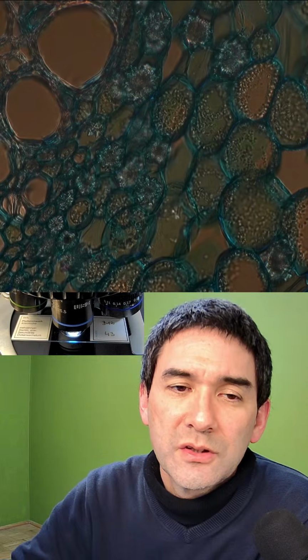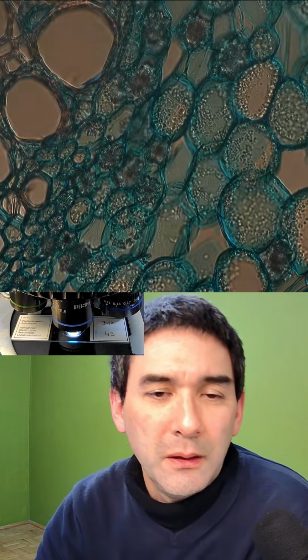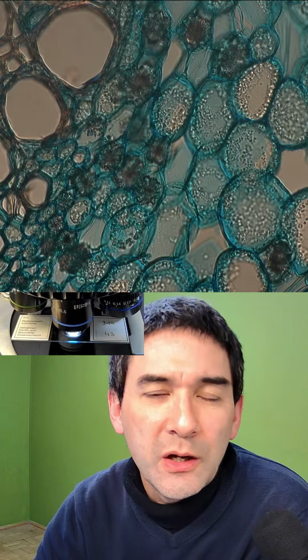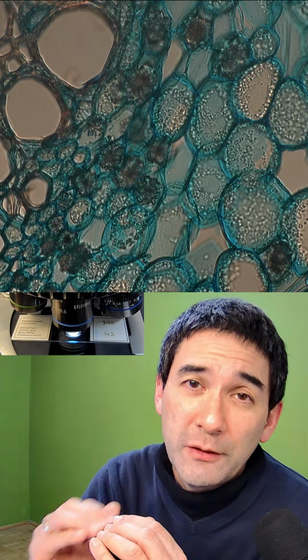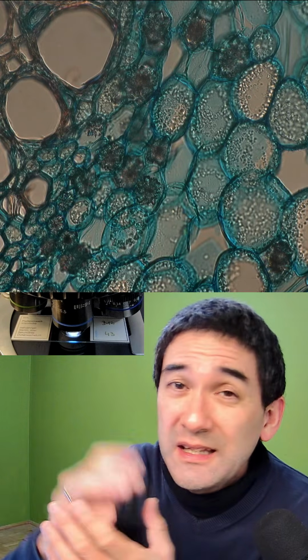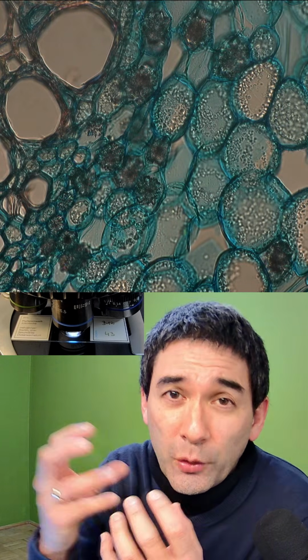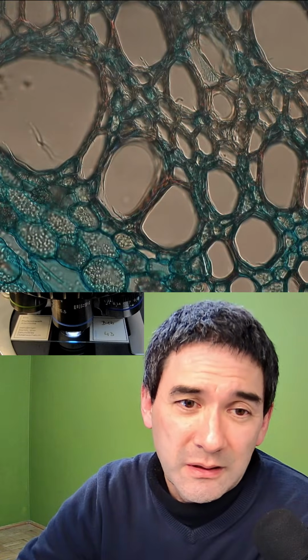So the thing is the following. Dust buildup is, of course, always a problem with microscopes. However, you will mostly only see the dust if it is close to the plane of focus, or maybe on your eyepieces. Inside, if there's some dust, you wouldn't see it anyway, because it's out of focus and blurry. So I would really not clean.